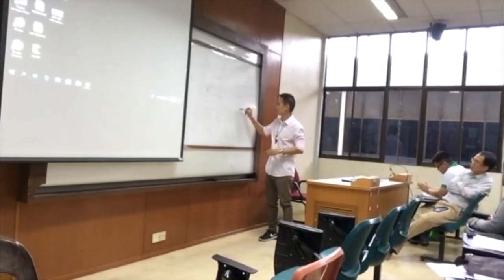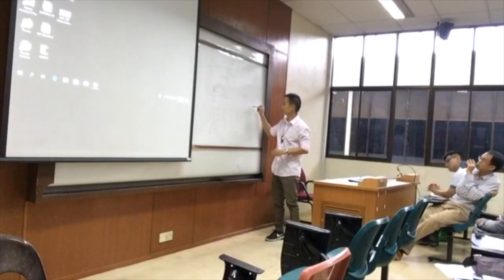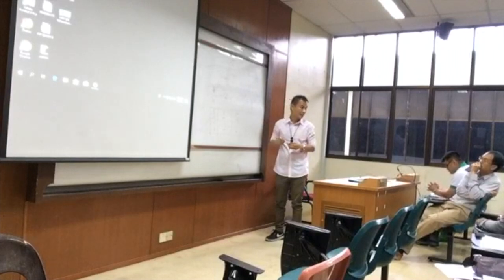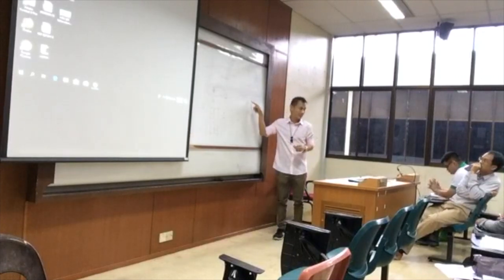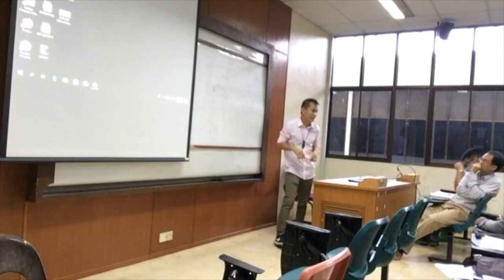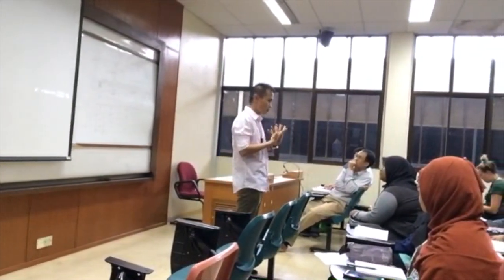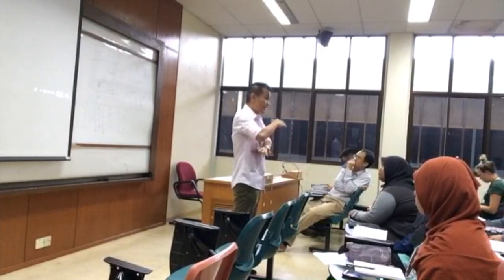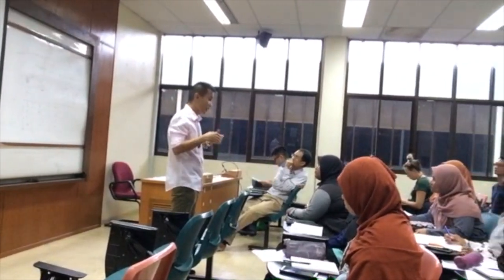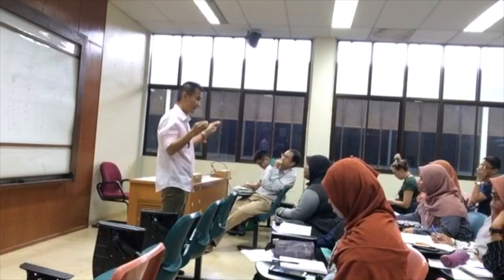So GC has a triple bond, AT has a double bond. Obviously, if there is more GC in the DNA strand, the DNA is going to be stronger than the one with AT, because it's only a double bond. Understand? So in the process, if you heat it too high, some DNA is going to break. So just put 65. You can actually go up to like 75, and sometimes we do that, but it's going to break the DNA.